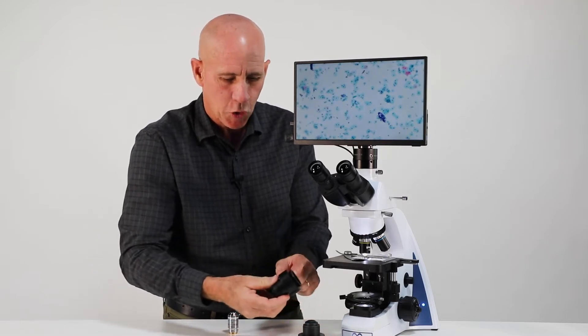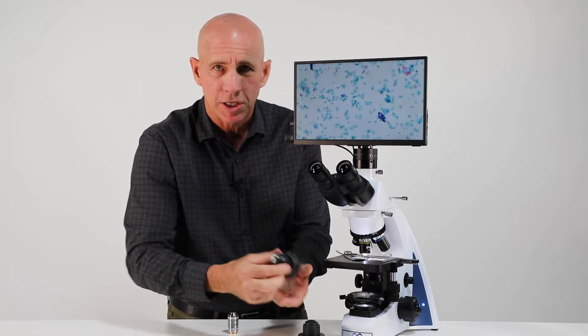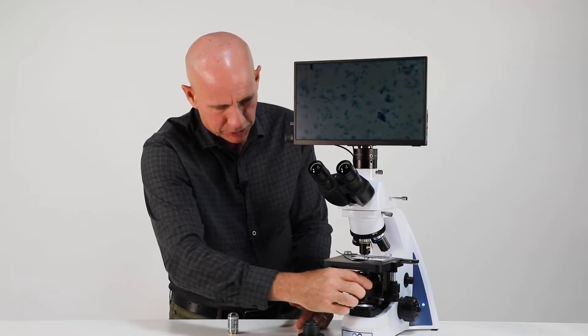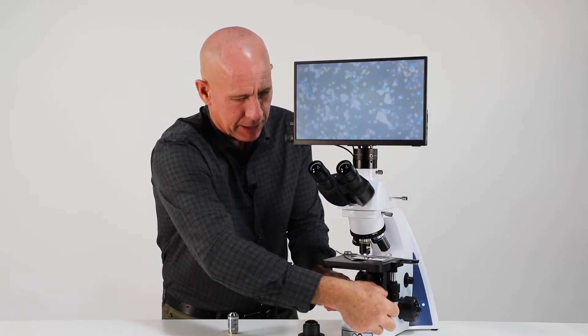But let's take that back out. The dark field condenser has no pin on it, there's no orientation, it doesn't really matter. So we're just going to slide it in and tighten it up.